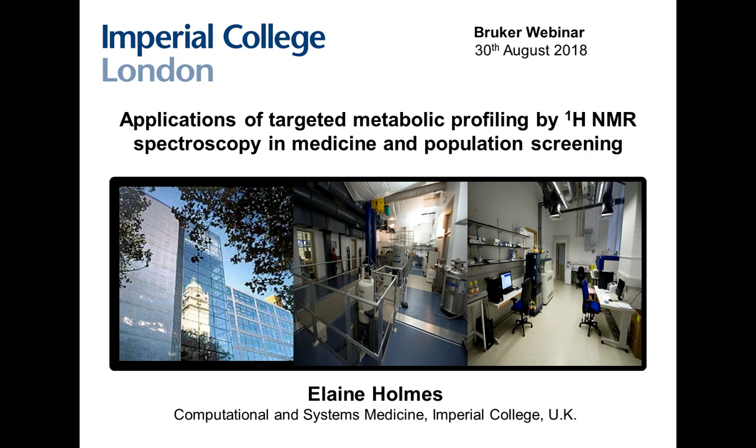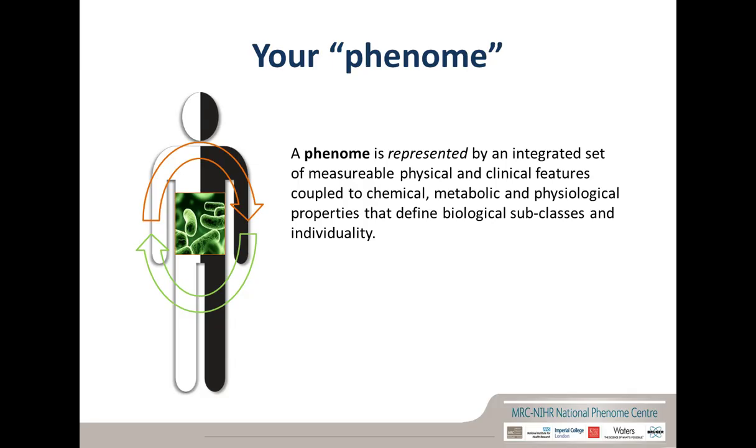Okay, so I'm based at Imperial College in London, and a lot of our NMR facility is part of what we have formed into the National Phenome Centre, and this is really set up to do high throughput screening of biofluids, mainly in the clinical arena. We also have a patient or more personalised medicine approach, which is part of our clinical Phenome Centre, and together they rely on NMR and mass spectrometry, but very heavily on NMR spectroscopy.